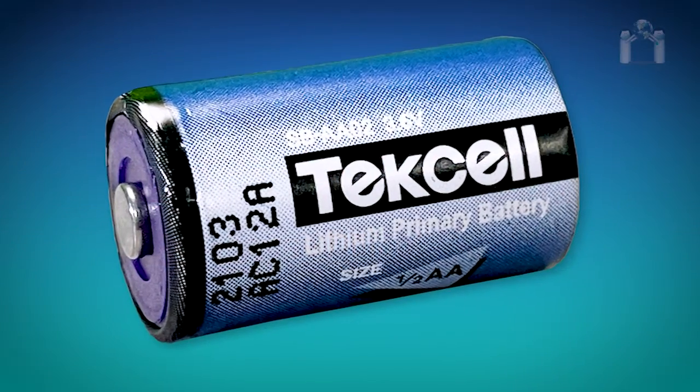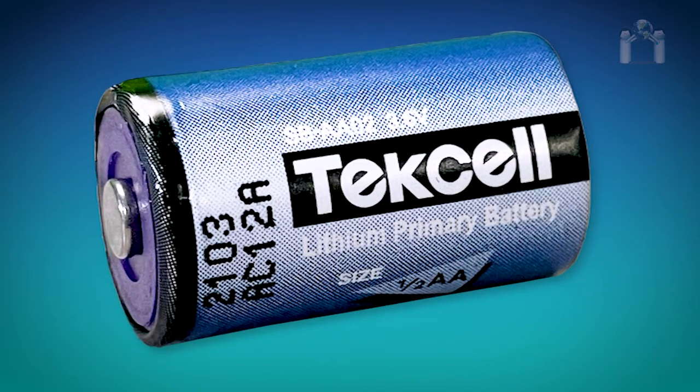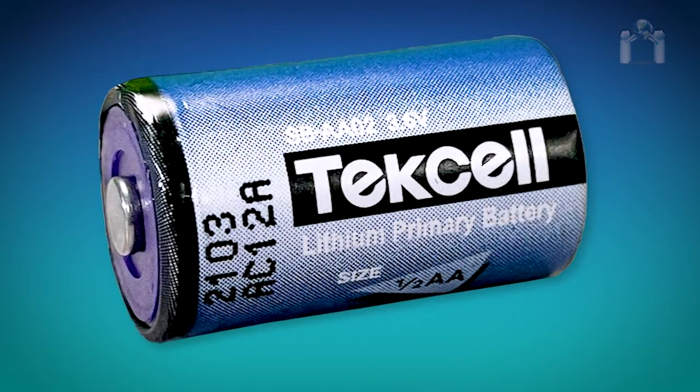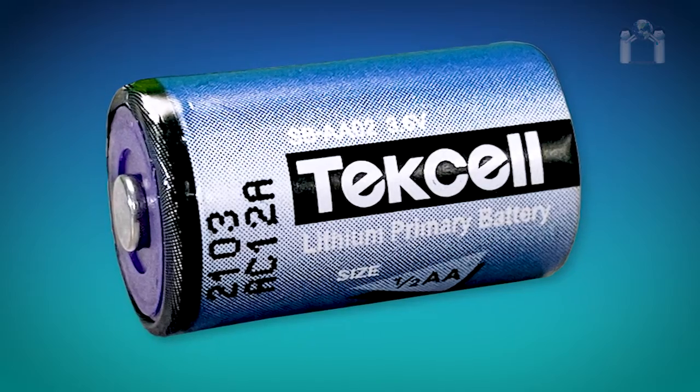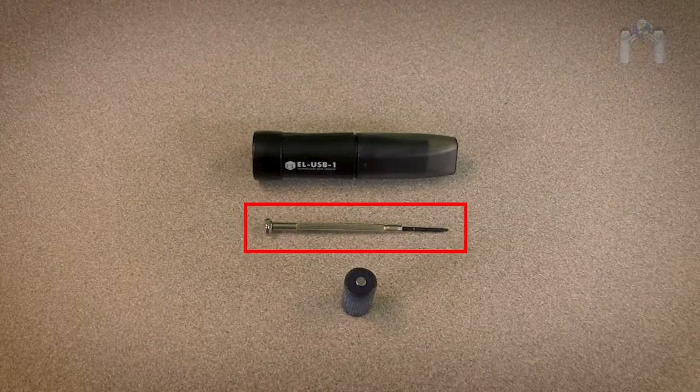To begin, let's talk about the battery. A one-half AA battery is included and pre-installed. However, if you need to install or change your battery, you will need a small tool to remove the battery cover. I find that a jeweler's screwdriver works best.